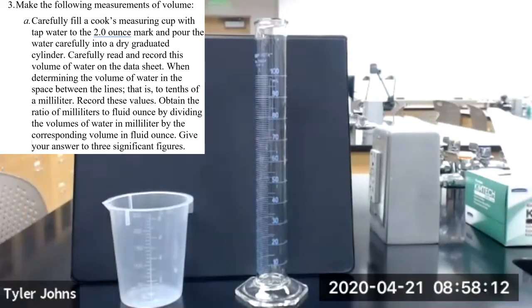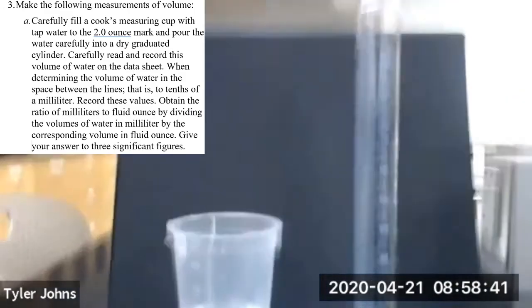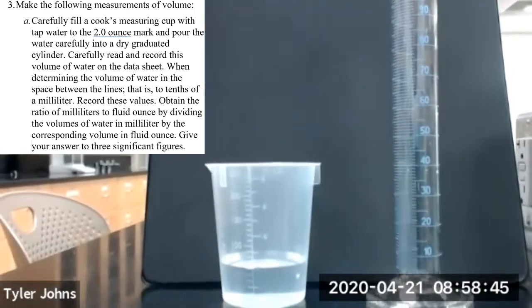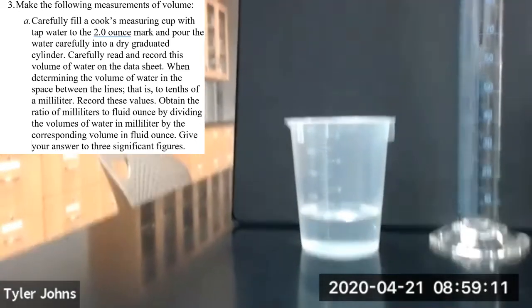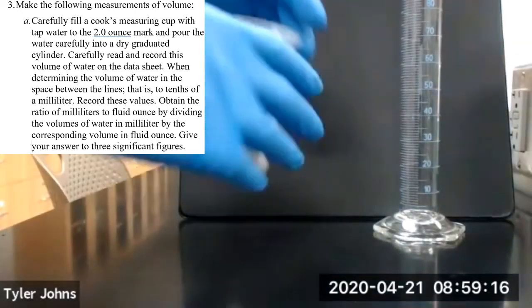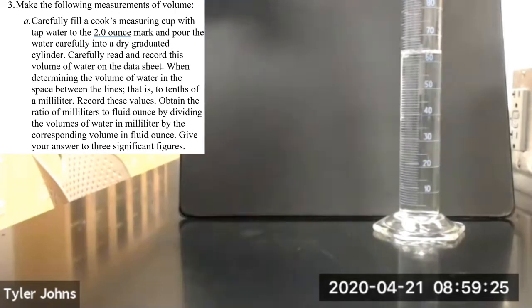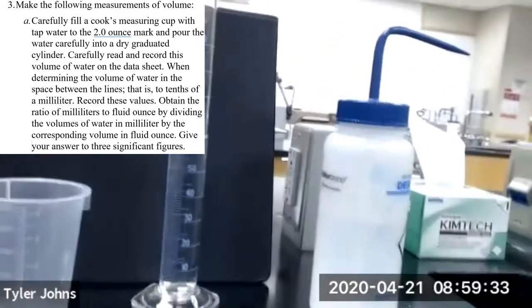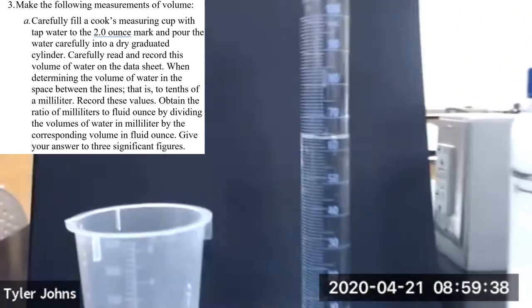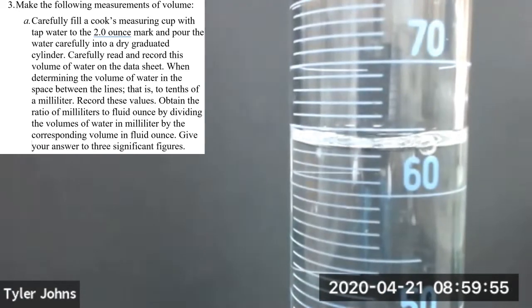So we'll take our water. You can see we have our 2 ounces, and now we're going to transfer that to our 100 ml graduated cylinder. And we'll record our volume in milliliters. We'll zoom in here. And this is our volume of the 2 ounces of water in milliliters.